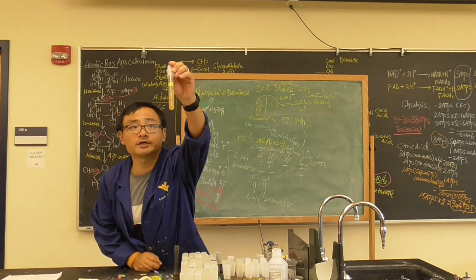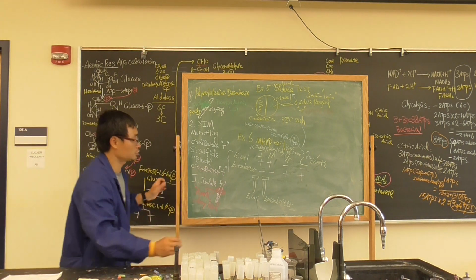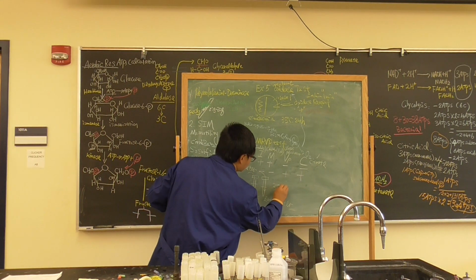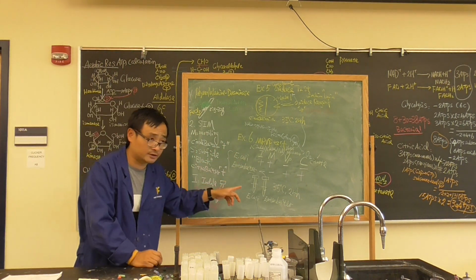Enterobacter is right here. You only take on these two tests. So you just add them there, and incubate at 35 degrees Celsius for 24 hours. And we will do the confirmation test on Tuesday. We'll talk more about it by then.